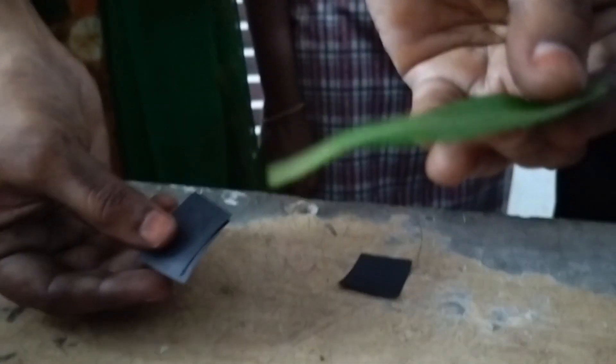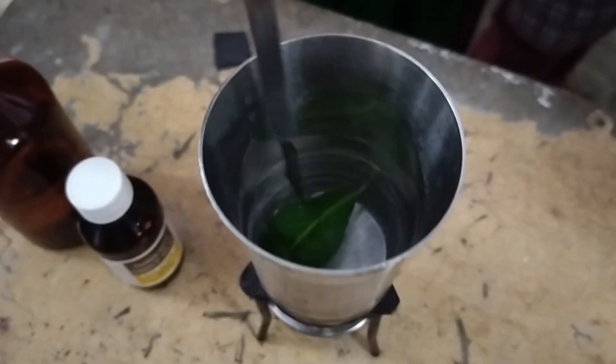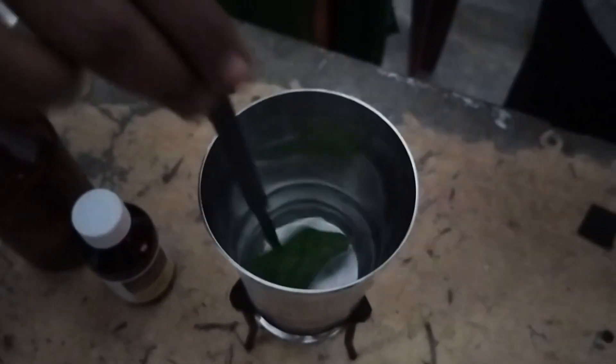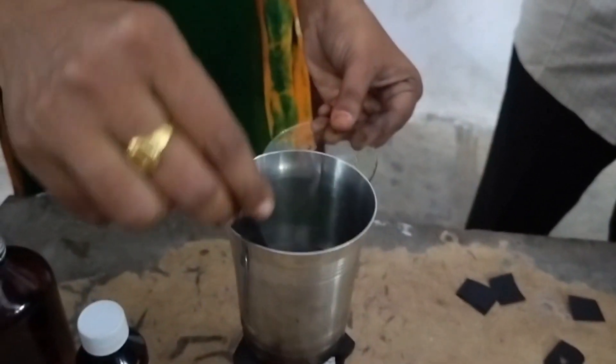Keep the leaf in hot water for a minute. We took 2 leaves for the experiment, so keep the 2 leaves in hot water. Take out the leaves after a minute.